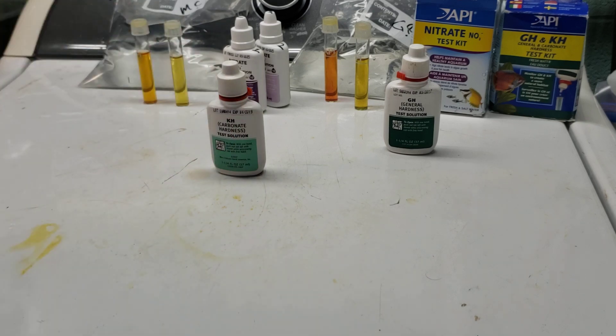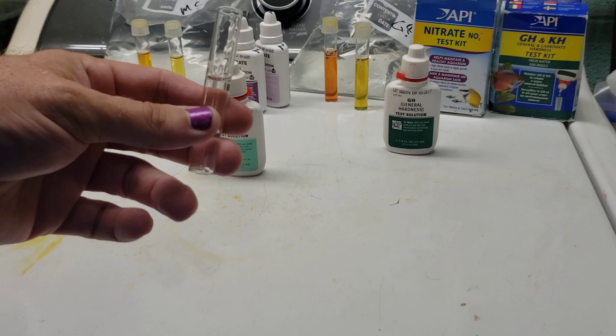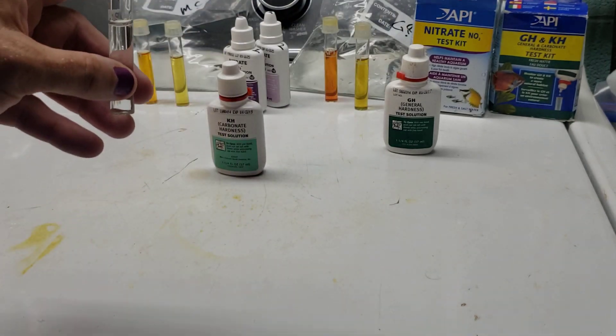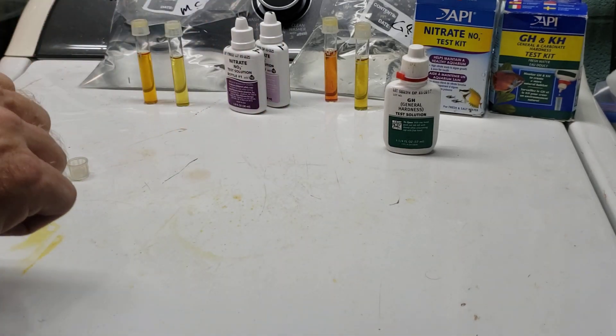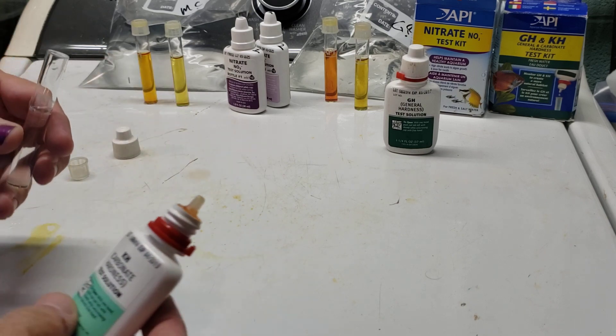Today I'm doing a test on some water I got from Pretty Boy Reservoir. I already tested the water that flows in from a tributary. This test is going to come out of this bag, so this will be the first time I've had a look at this. We'll see how close it is to the two degrees Carbonate Hardness that the other one was.